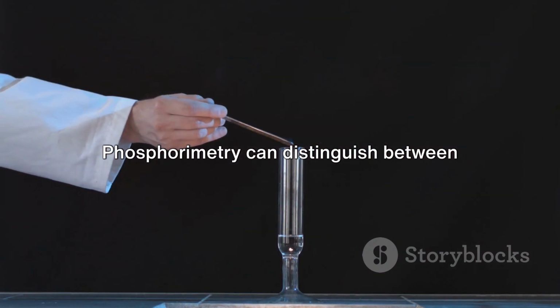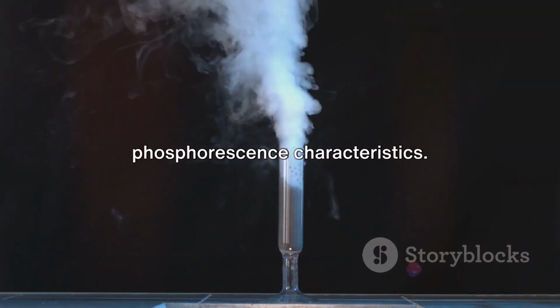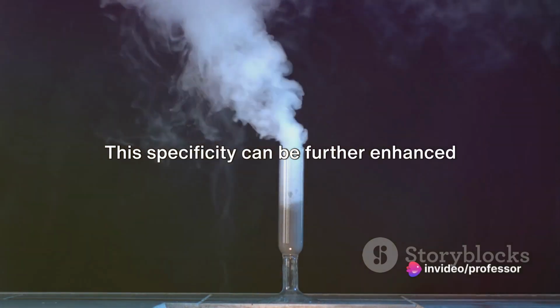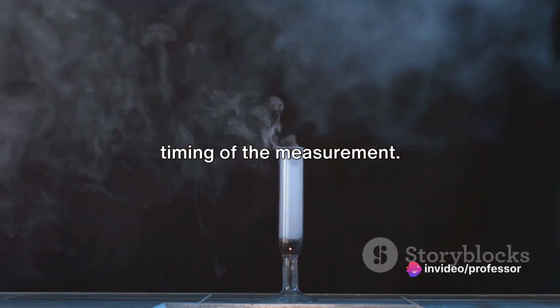Phosphorimetry can distinguish between different substances based on their unique phosphorescence characteristics. This specificity can be further enhanced by manipulating the temperature and the timing of the measurement.